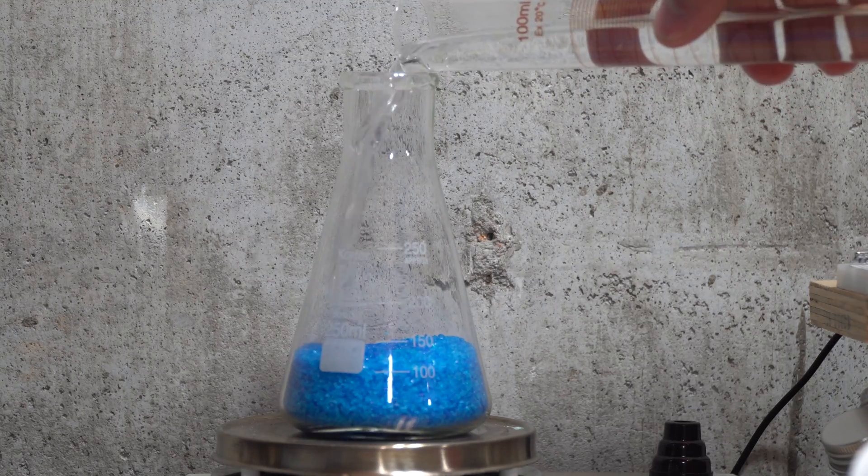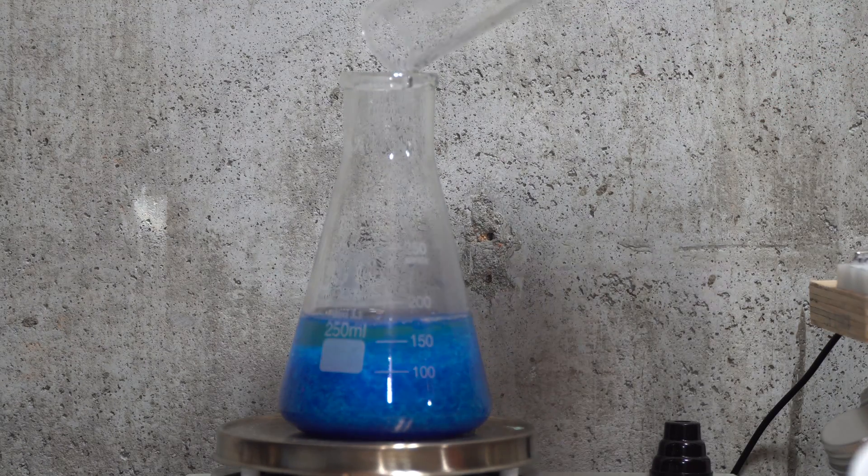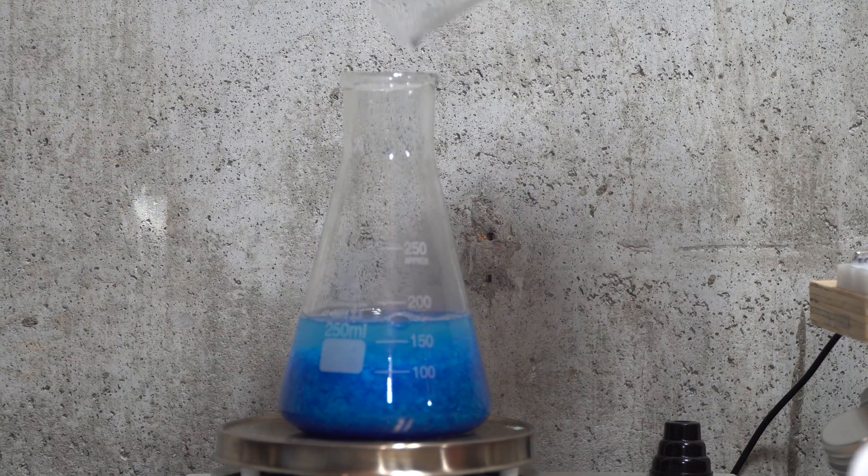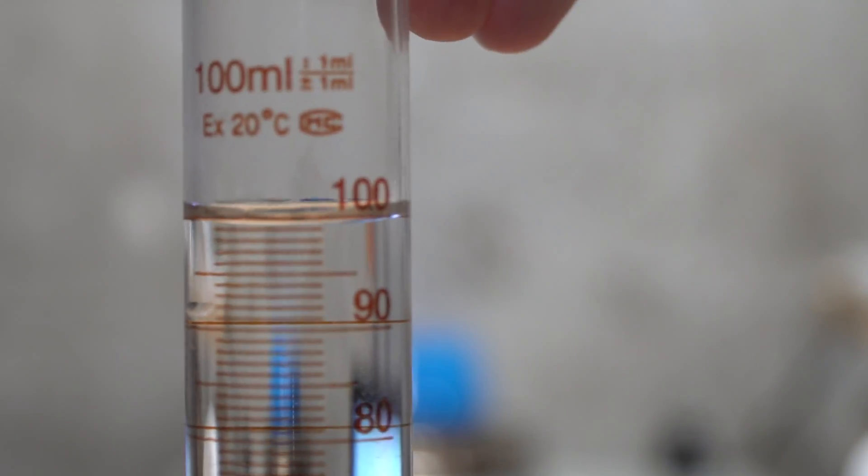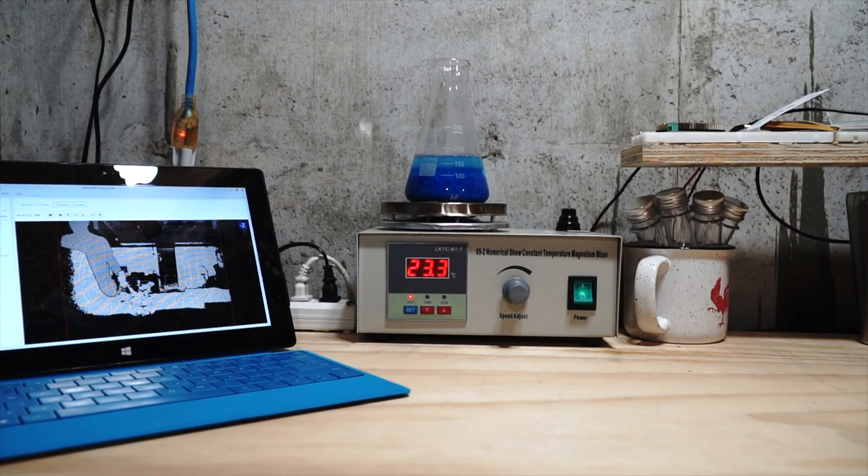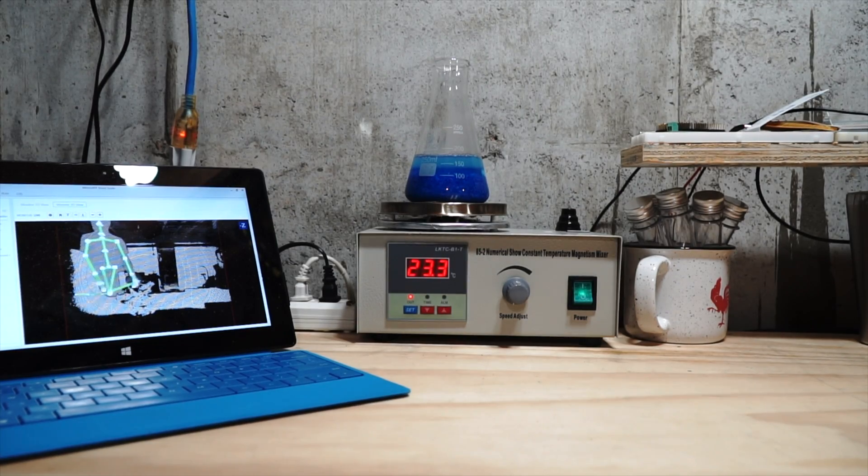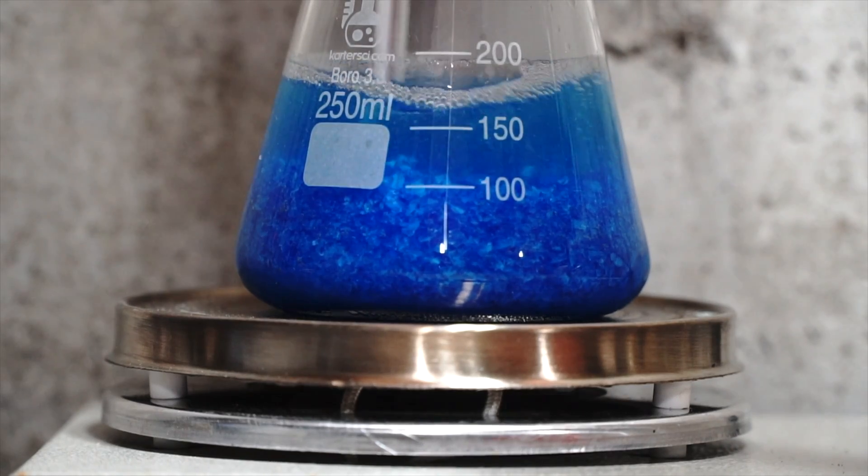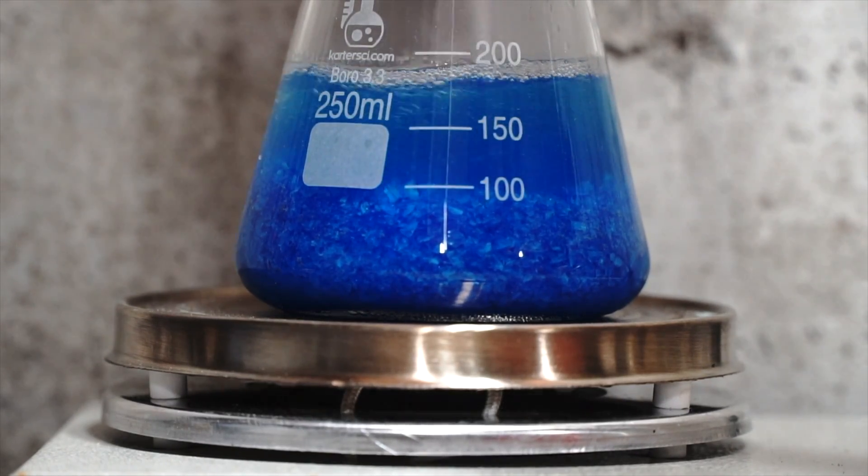Alright, here we go. Right here I'm adding about 100 milliliters of water to about 160 grams of copper sulfate crystals, or regular store-bought root be gone. At boiling, 100 milliliters of water should dissolve about 74 grams of copper sulfate, so in total I'll use about 200 milliliters.